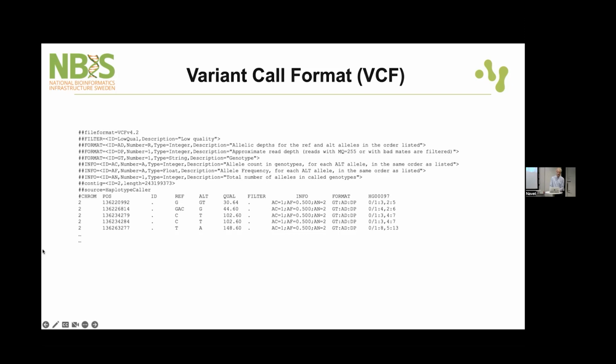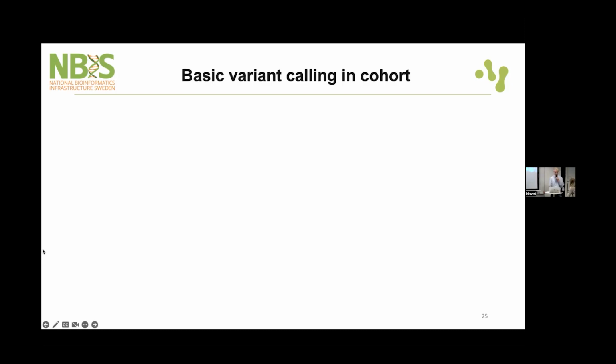However, analyzing a different sample will give us a different set of putative variants. So we won't have the exact same rows. So we need a way to merge them into a combined VCF.